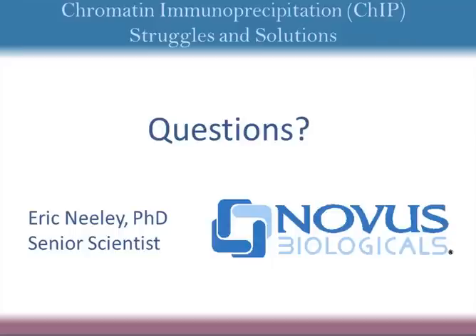Yep, I guess it'll make the whole thing more reproducible as well, using the automated protocol. Yeah, I always include a positive control antibody with all of our tests here for doing ChIPs to validate any of our antibodies, and it's really amazing how consistent the results are.